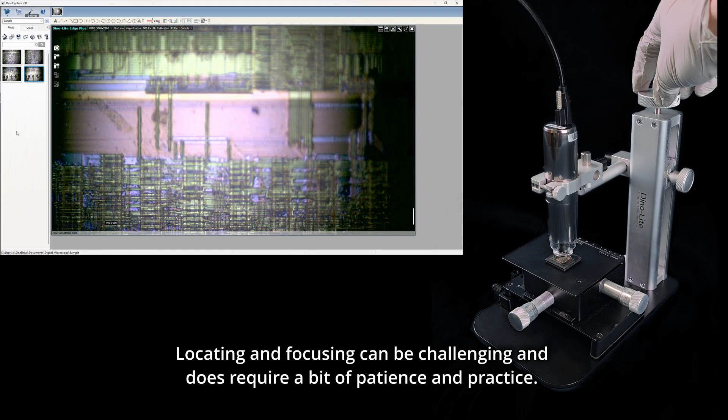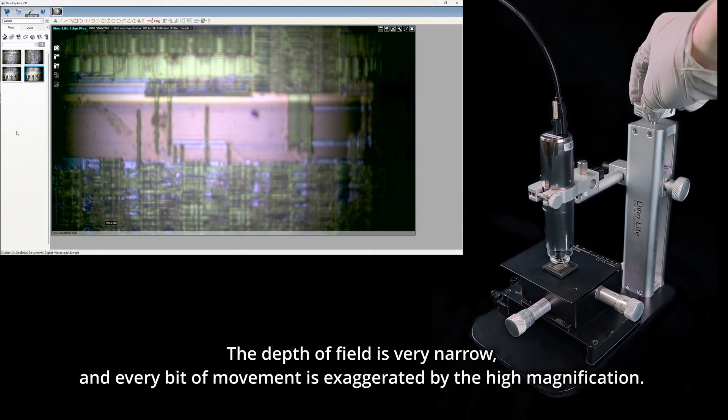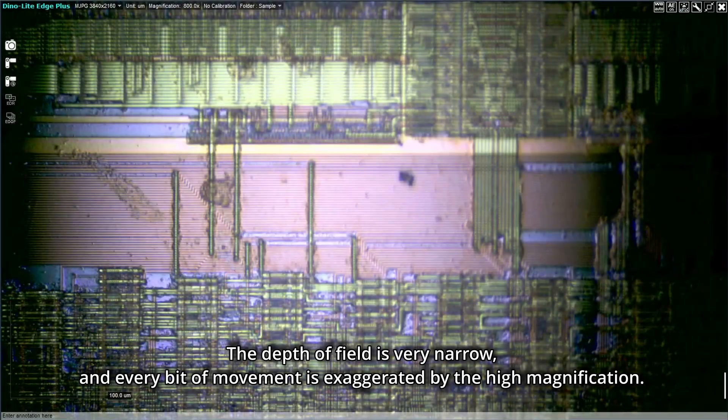Locating and focusing can be challenging and does require a bit of patience and practice. The depth of field is very narrow, and every bit of movement is exaggerated by the high magnification.